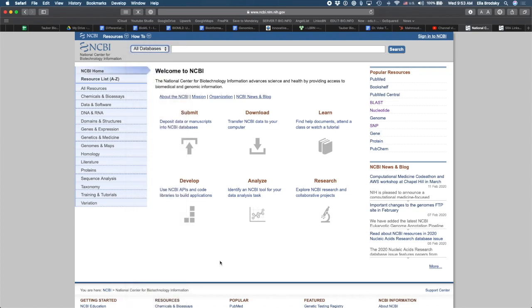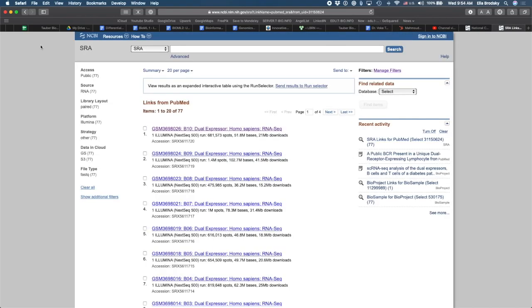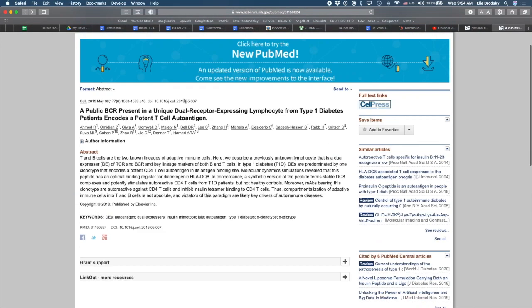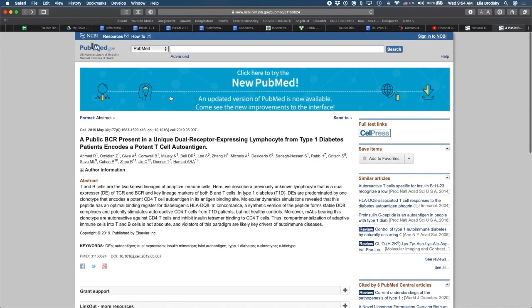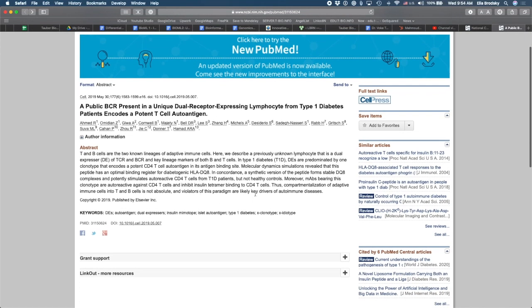So let's say I'm interested in diabetes, and there's a recent article that came out. And that recent article is going to come from a data set. Let's just find here an article. You can see a public BCR present in a unique dual receptor expressing lymphocyte from type 1 diabetes patients encoded in a potent T cell autoantigen. So this paper was published in Cell Press. How do we find the data that was published with this paper? This paper was published in 2019.